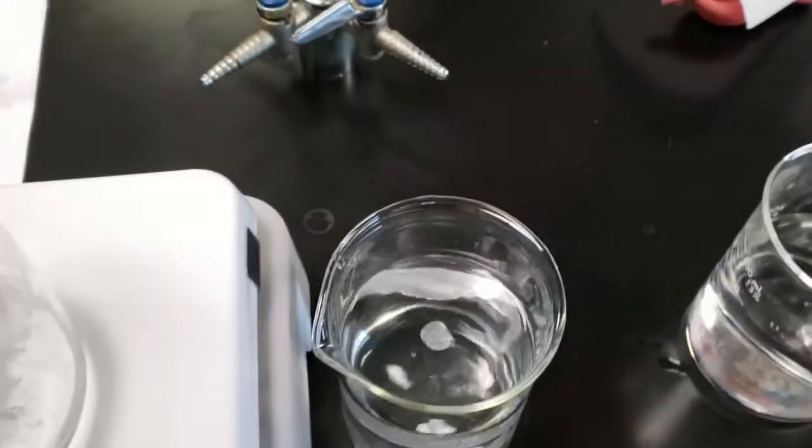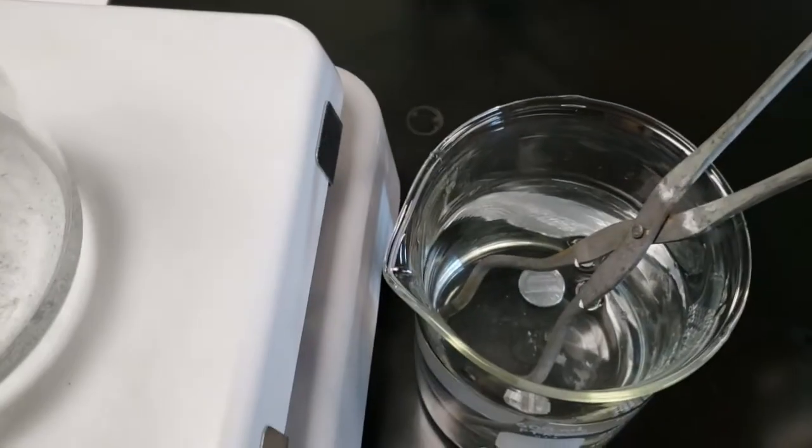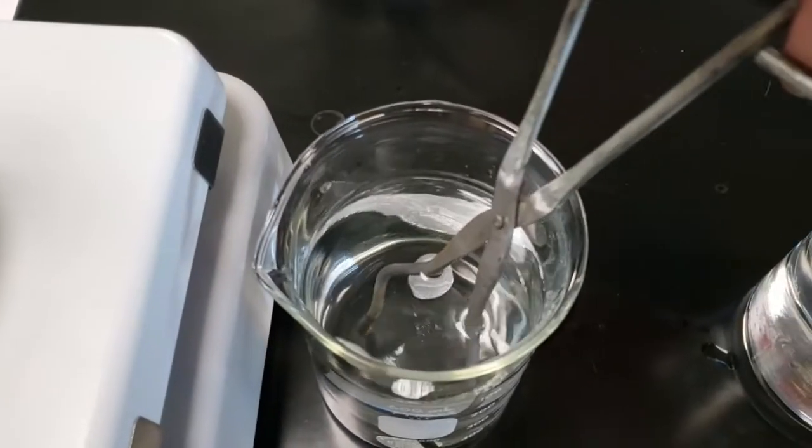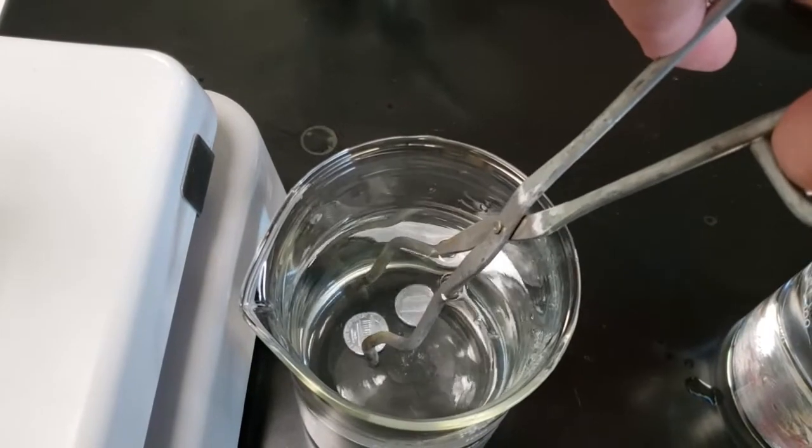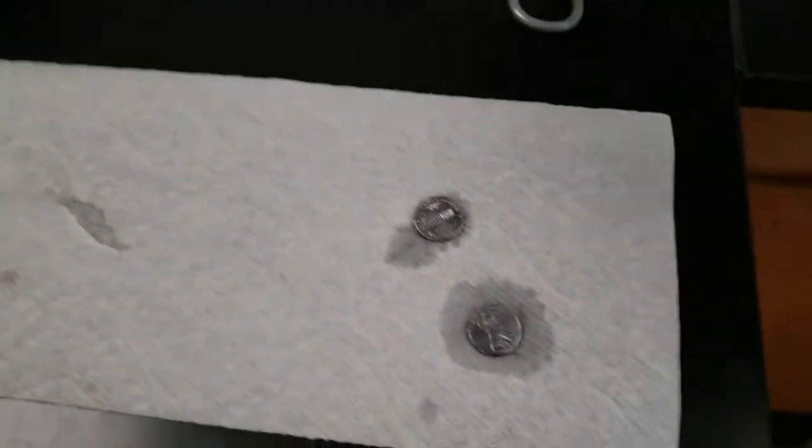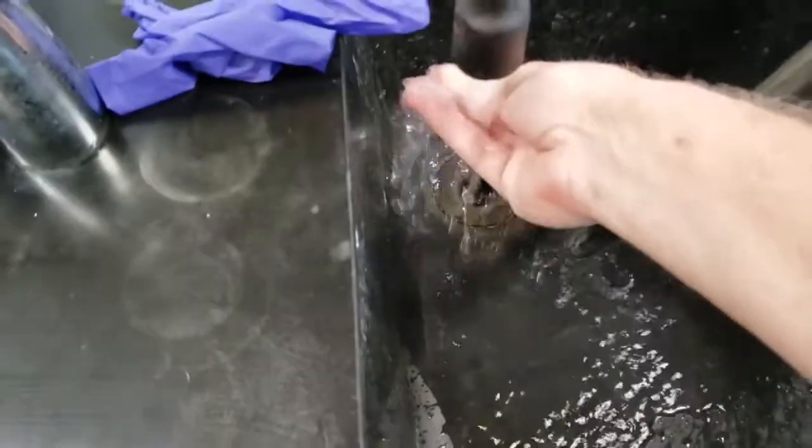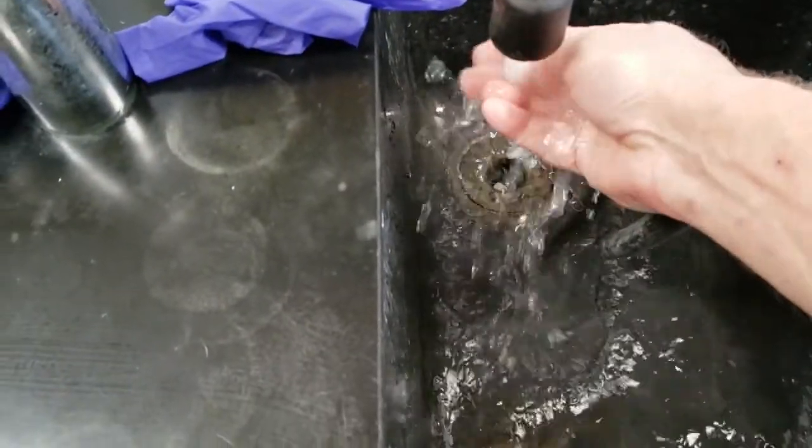Then we're gonna take it out. First of all, it's not gonna be hot anymore, this is just room temperature water. We're gonna take it out and bring it over to the faucet and rinse it off. See, they look silver. A little running water going.